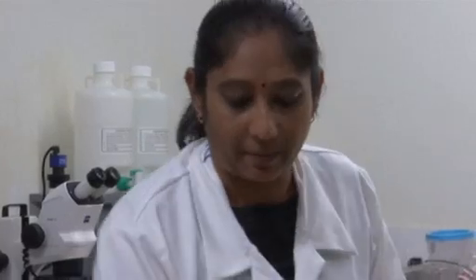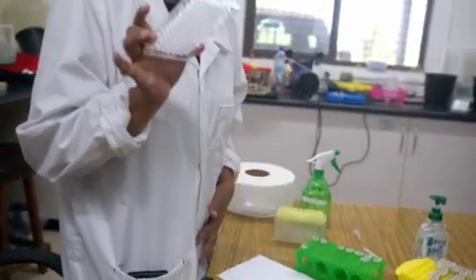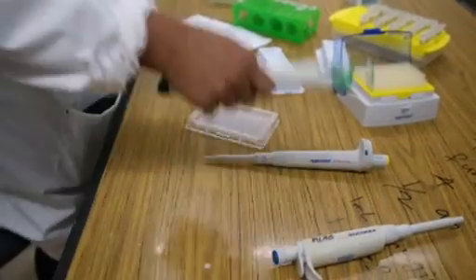We use a microplate for analysis, and this is what we call a microplate.